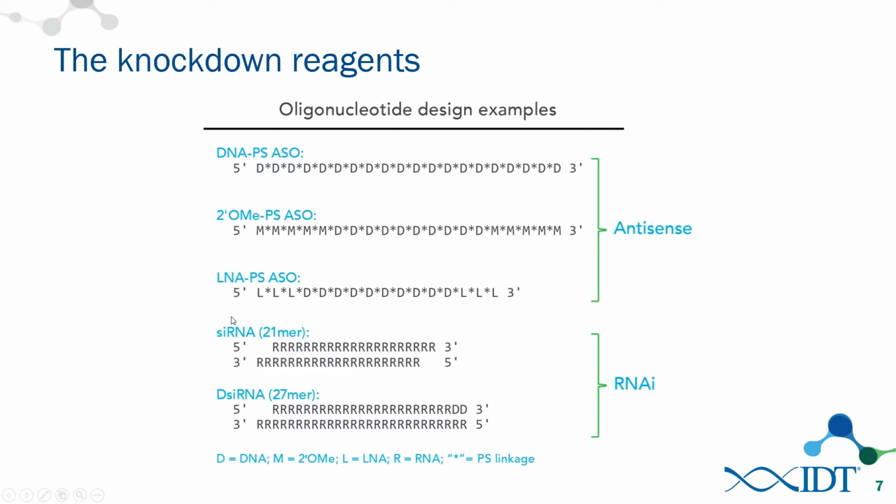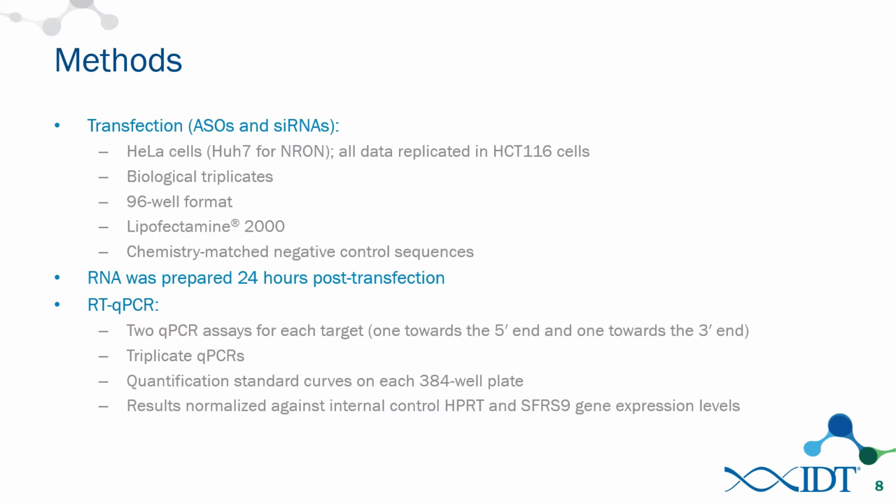The siRNAs that were used are double-stranded short RNAs, which have the 2 base 3' overhangs on both the guide strand and the passenger strand. The Dicer substrates are 27-mers, which indicates the length of the guide strand. They're asymmetric designs in that one end is blunt. The other end has the 3' overhang on the guide strand. And on the sense strand, there are also these DNA bases here, which serve to reduce unintended loading of the passenger strand into RISC.